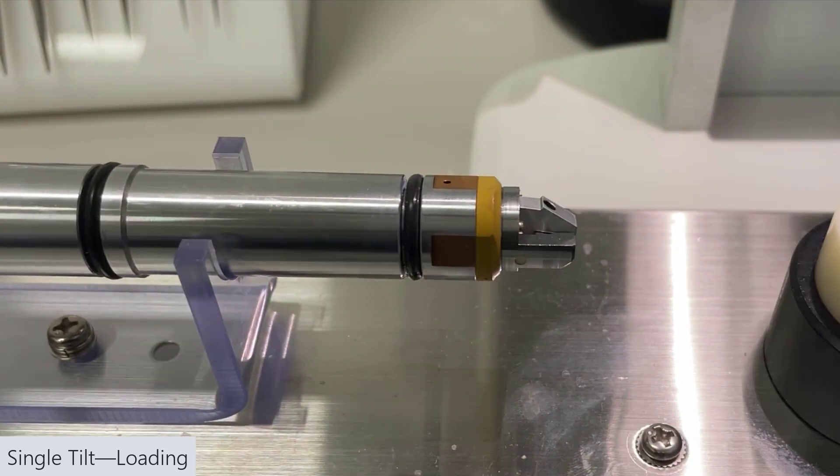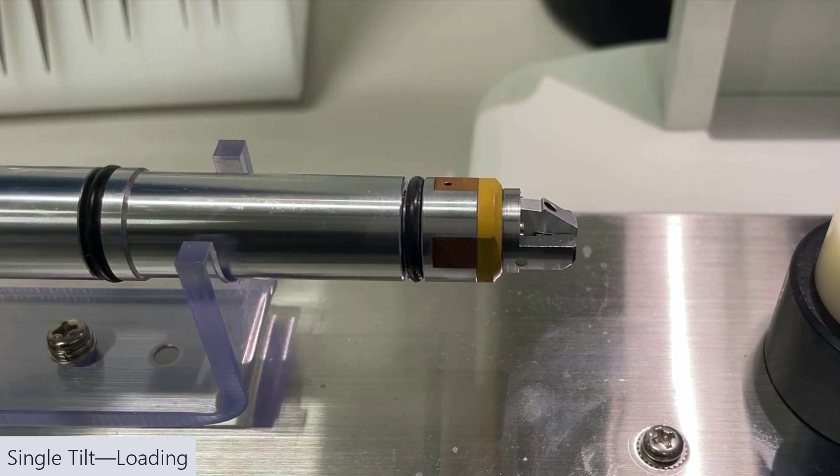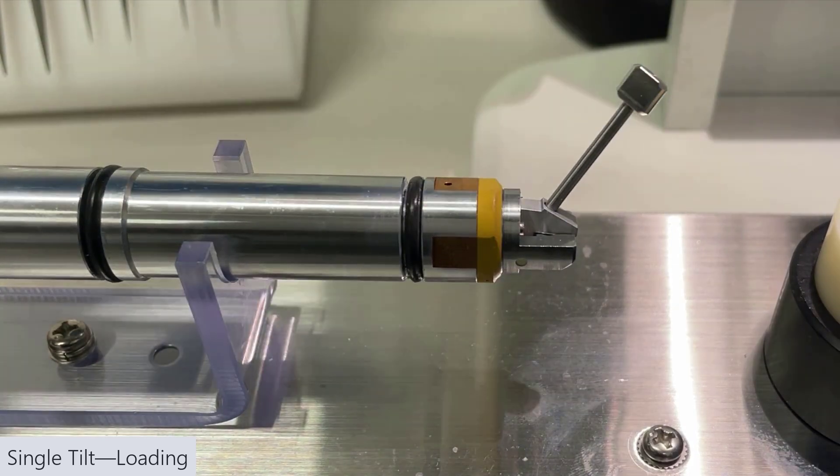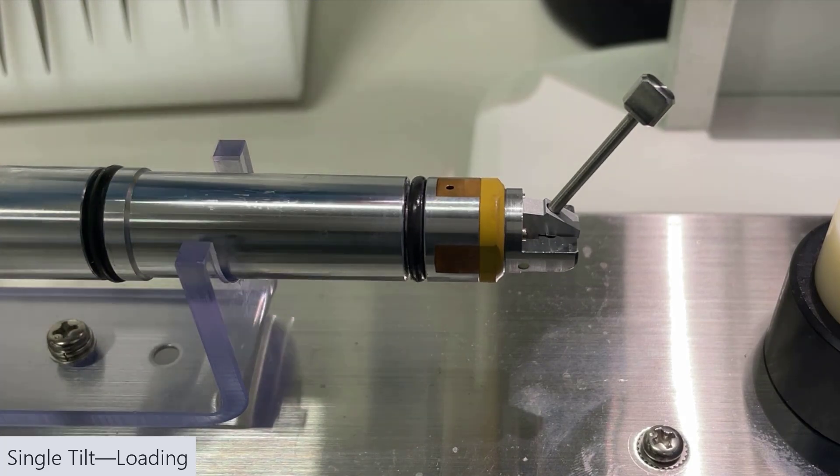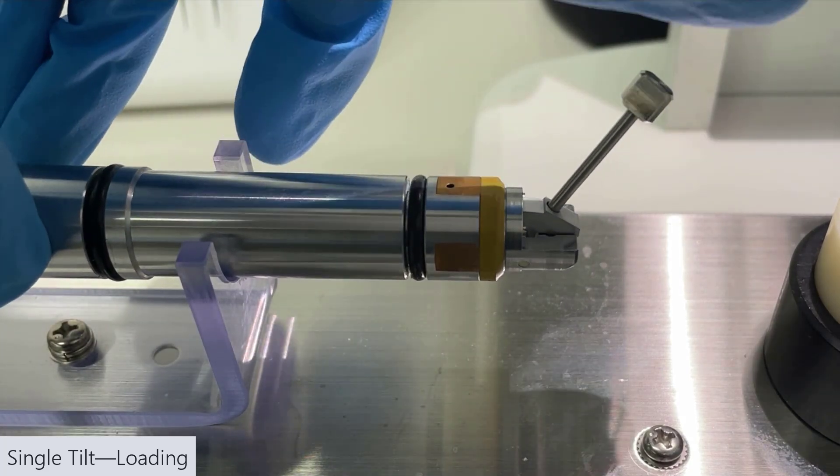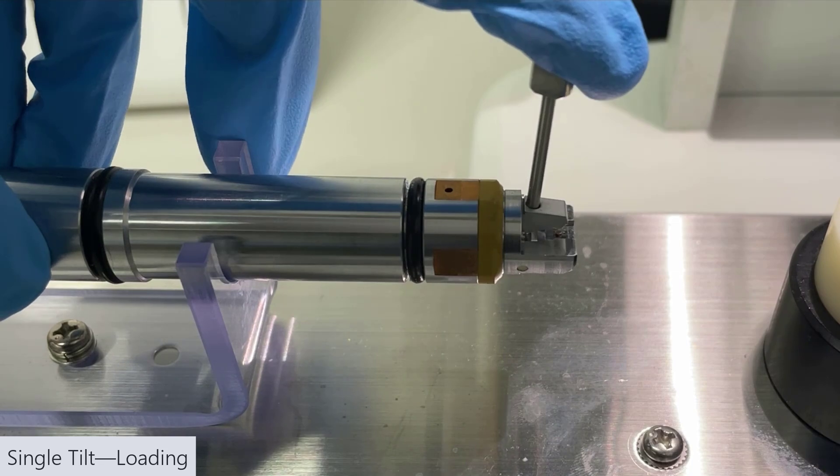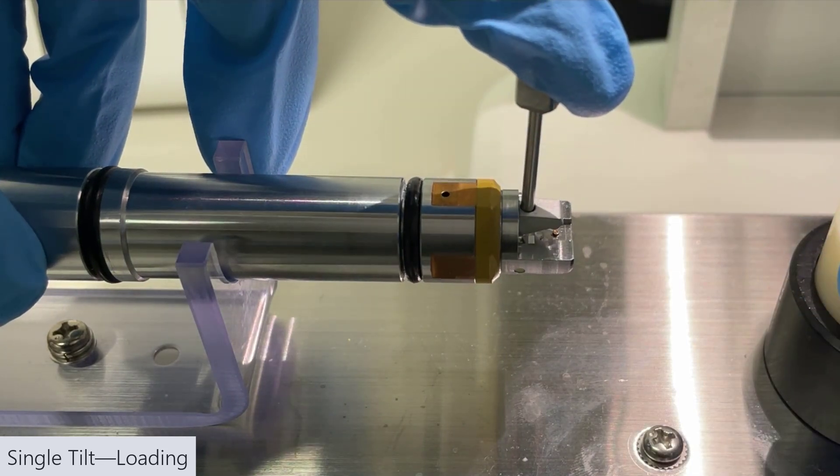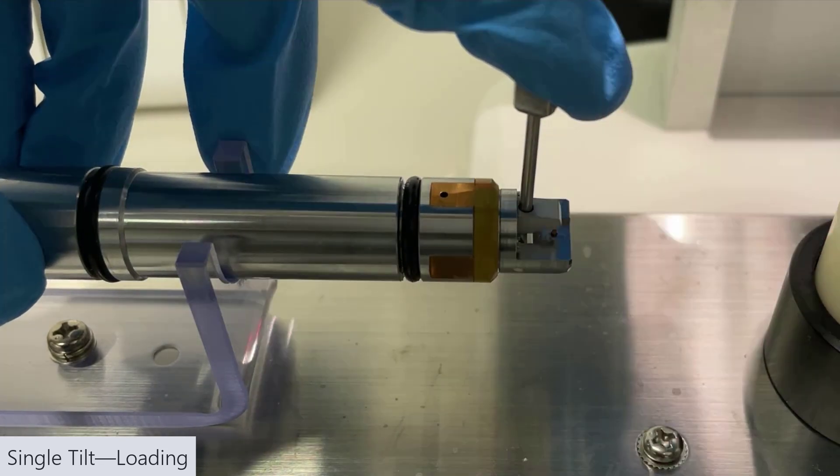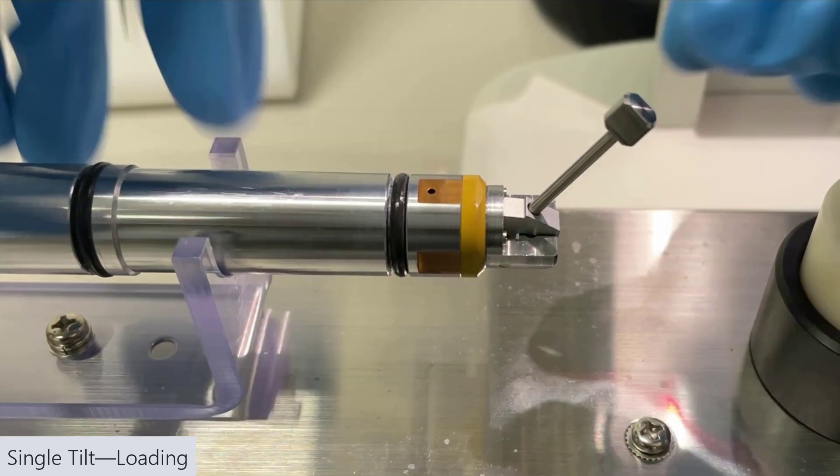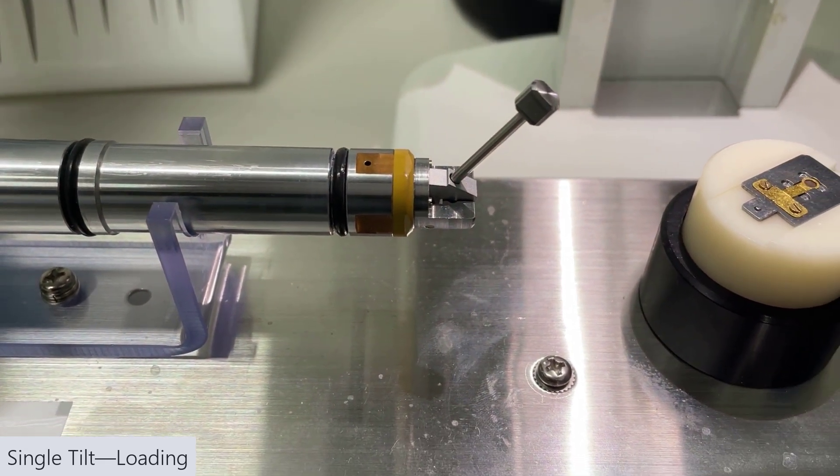To do that, we're going to grab a little metal rod that comes with the holder and put it in the hole there on the top. Now if you grip the holder rod, you'll be able to see that there's a little pin when we pull it back. We want our blade, the hole at the end of the blade, to fit into that pin.